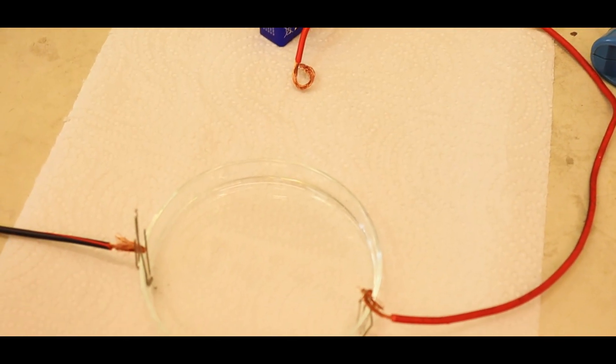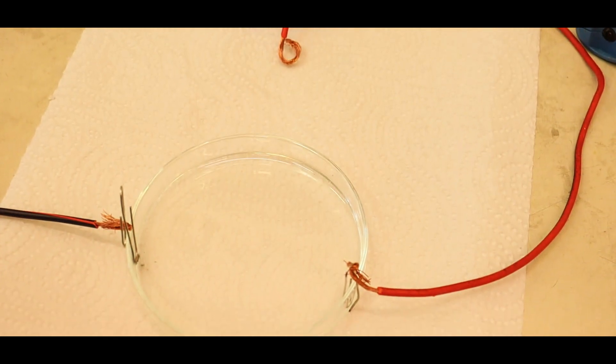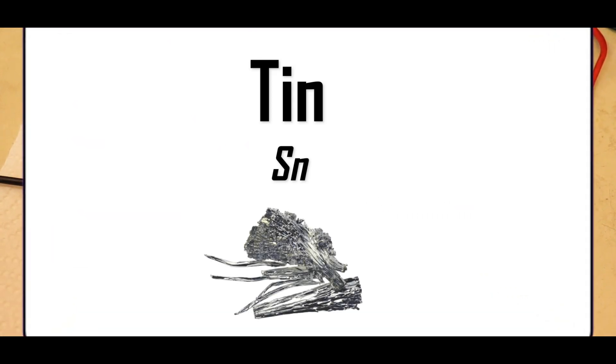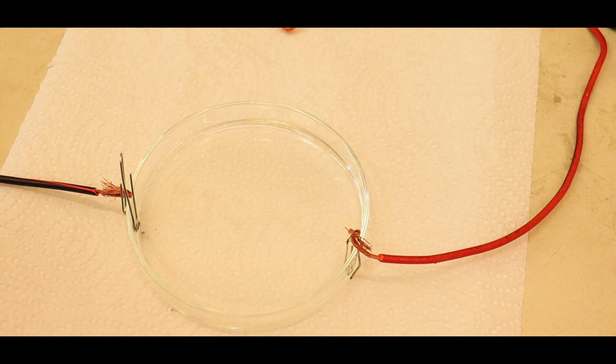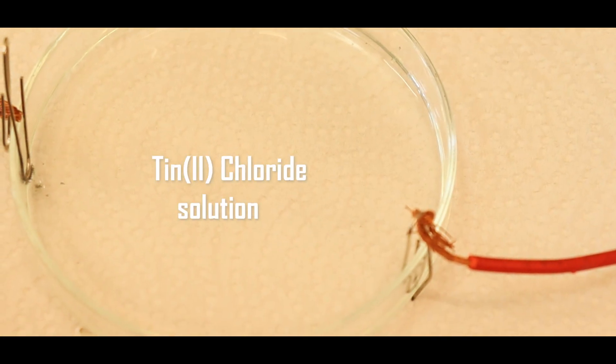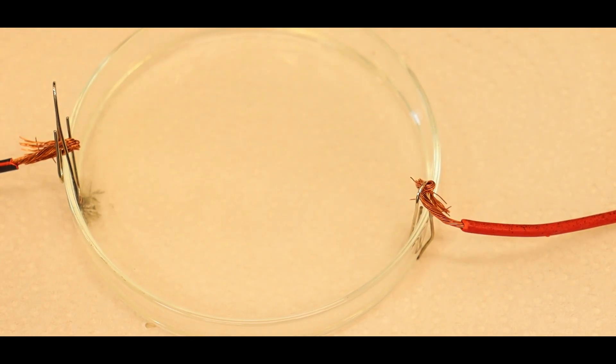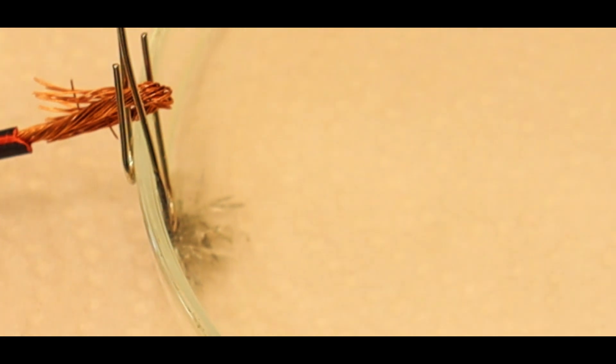This next experiment isn't related to silver nitrate, but we've included it anyway. It is another experiment in which metal crystals grow, this time tin crystals. It is performed by connecting a battery into a tin chloride solution. The electrons reduce the tin chloride to elemental tin, and the metal then forms crystals which start to grow towards the other pole of the battery.